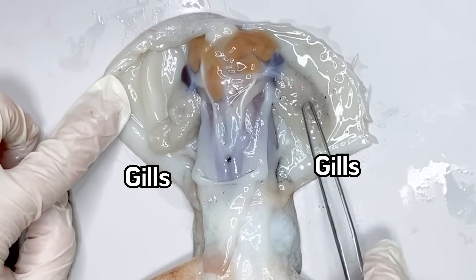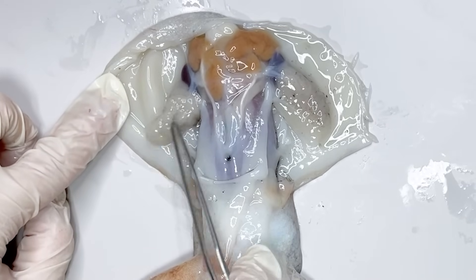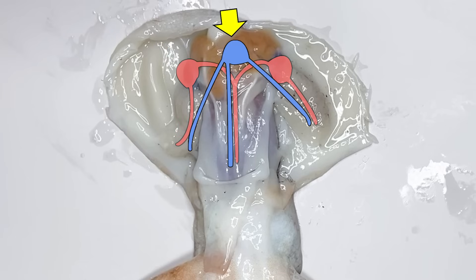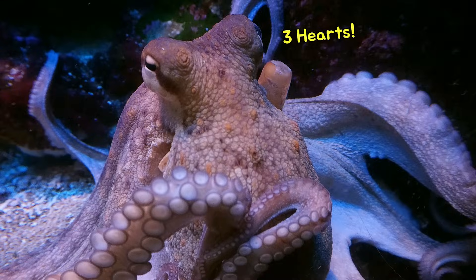This leaf-shaped structure is the gills. Above the gills, the branchial heart is positioned there. Octopuses have two branchial hearts on either side and one systemic heart in the middle of their bodies, so they have three hearts in total.